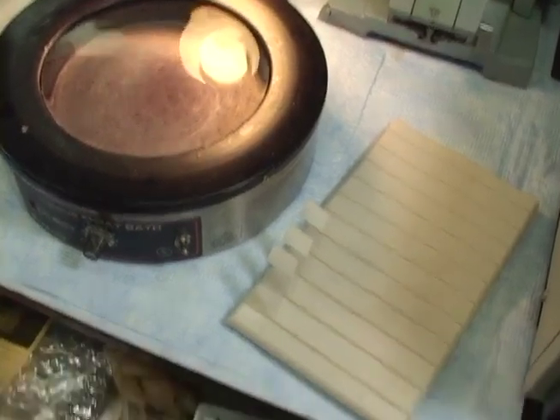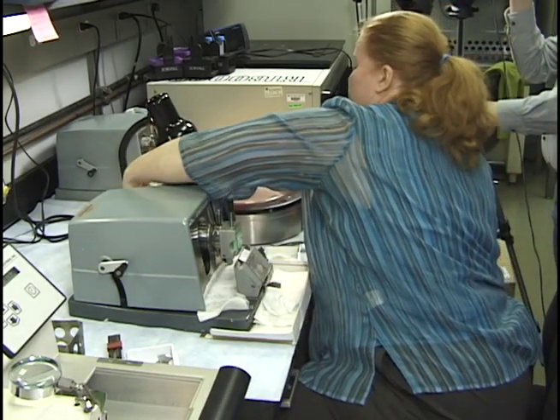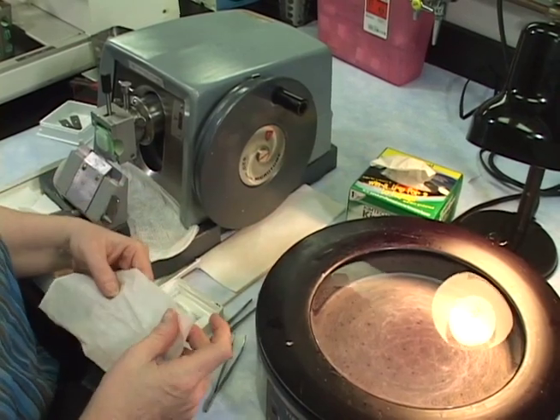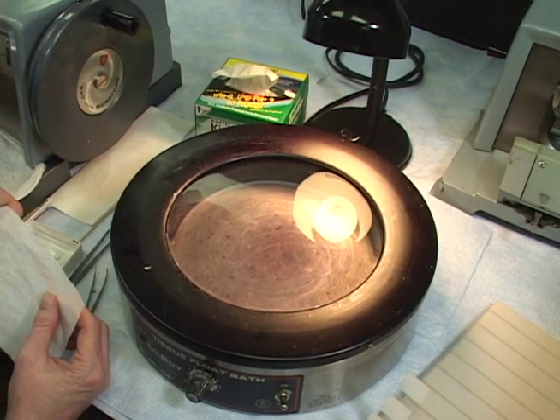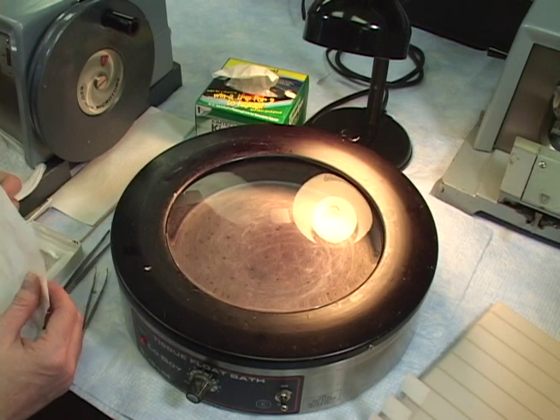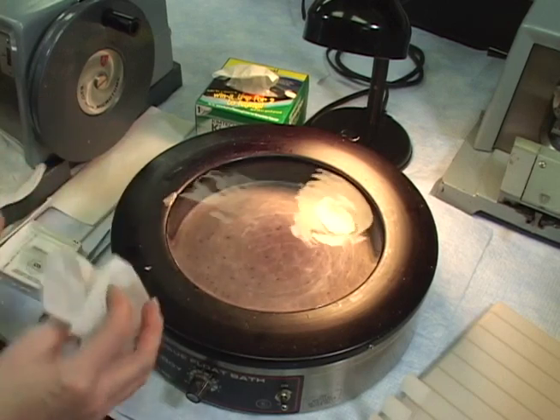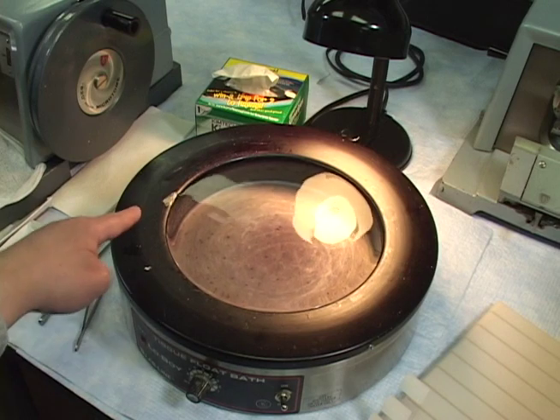Now, between every ribbon, I keep Kim wipes. I keep them in the drawer. After every block, I always swipe the water bath. I do that, number one, because you don't want to pick up what we call floaters onto your slide. And number two, you don't want to ever take the risk of picking up another section and having two different sections from two different blocks on the same slide. So it's better to just waste a Kim wipe and swipe the water bath every time. I just swipe it across, and then you're done and you discard the Kim wipe. You do that between every block.